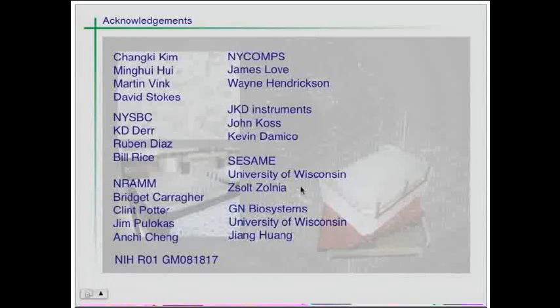Okay, so to follow up on that question then, what has been the follow-up success rate with optimizing those conditions to yield diffraction quality crystals? Yeah, at the moment we are optimizing 6 of those candidates, and the success rate of optimizing from tubes to diffracting tubes is about, of those 6 we get 2 so far in the diffraction.